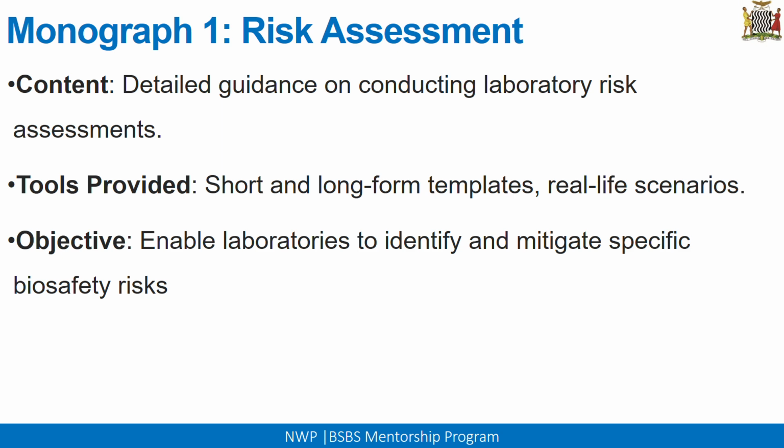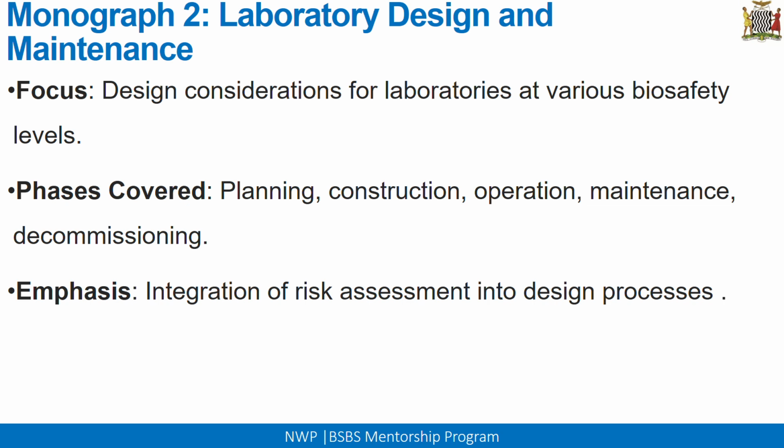So one of the objectives for this particular monograph is that it enables laboratories to identify and mitigate specific biosafety risks. So emphasis on the biosafety risks. So mostly it will guide you on how to do a biosafety risk assessment, and at a much lower level of detail on how to do a biosecurity risk assessment. So let's look at the second monograph, the laboratory design and maintenance.